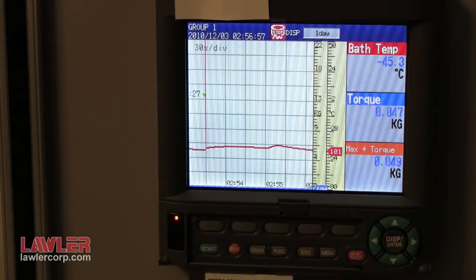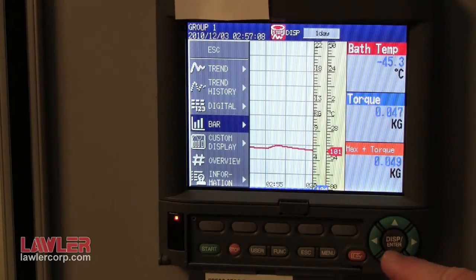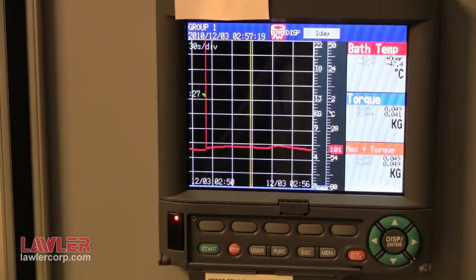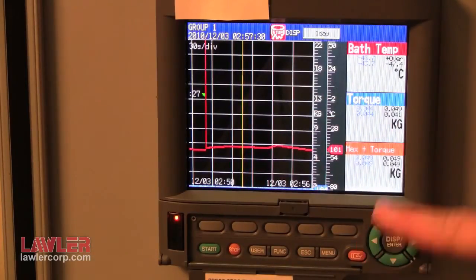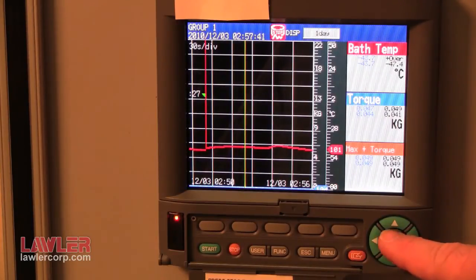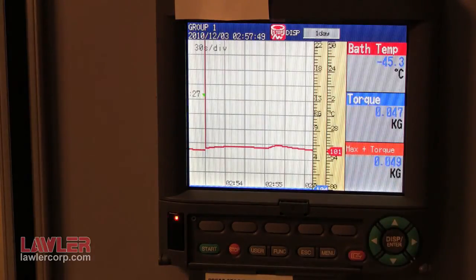The recorder has a historical mode that can be used on screen instead of going to the computer and using the compact flash. Press the enter button and you can navigate to the menu called trend history. Press enter and you can see the recorder is in inverse video to indicate that it is in historical mode. You can use the arrow keys to navigate a yellow line across the screen to the desired points, and they are displayed digitally under each variable's tag name. To return, simply press exit and you are back into recording mode.